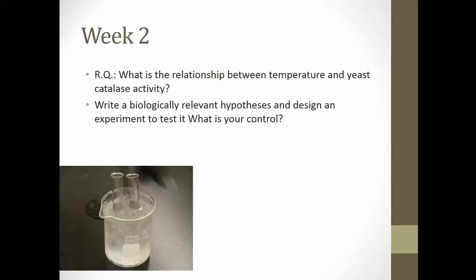Instead, we are going to vary temperature and see how temperature affects the rate of the reaction. This will show us a lot of very important fundamental concepts of both chemistry and biology. It'll show us what enzymes do. It'll give us an insight into the importance of homeostasis. And possibly we'll see what happens when an enzyme is denatured.